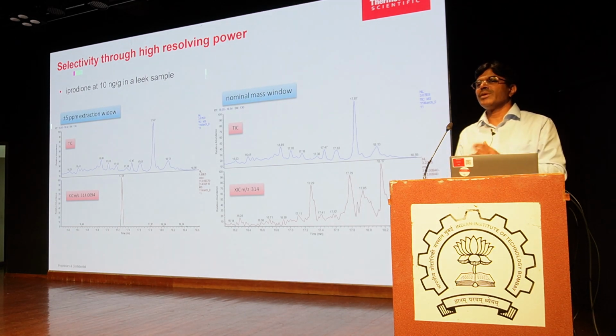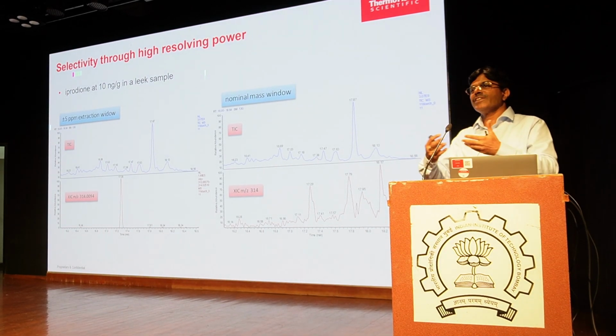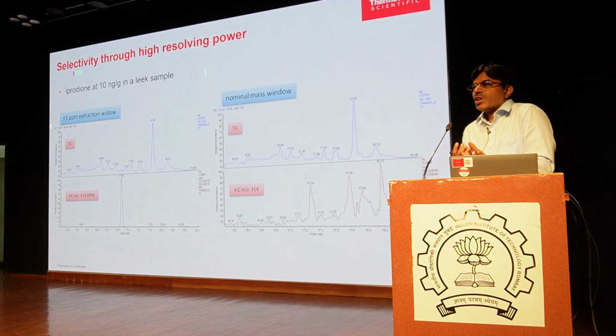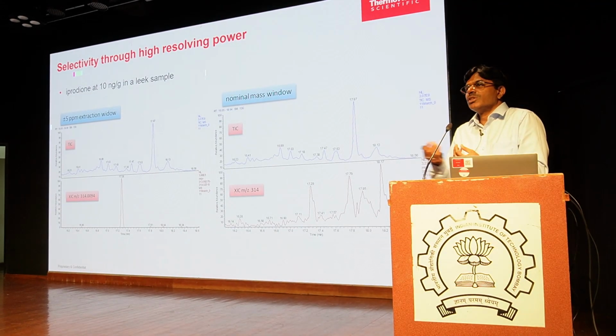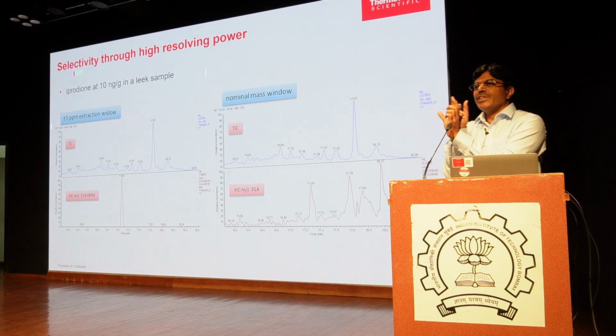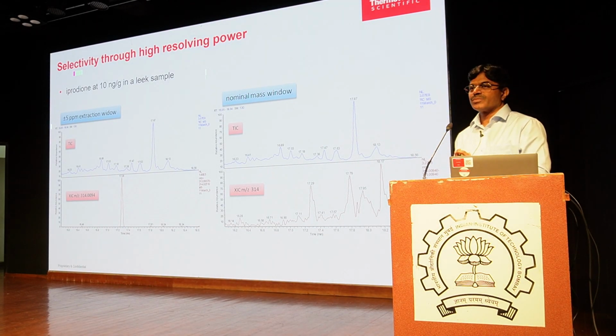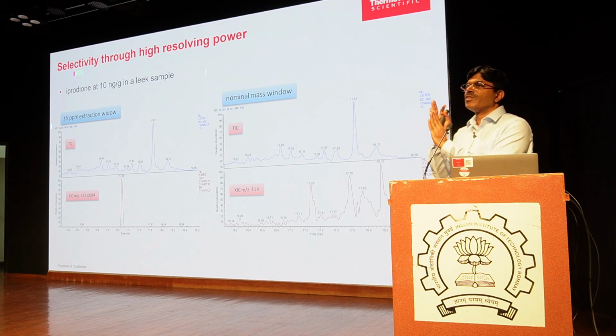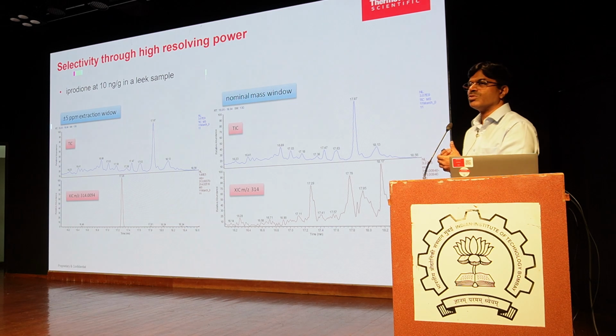I'm not able to see my peak because the background is giving a lot of interference, which is 314, containing 314 ion. It may be 314.12, 314.15, 17, whatever. But the window of that is 1 delta, so anything from 313.5 to 314.5 is all shown as 314.